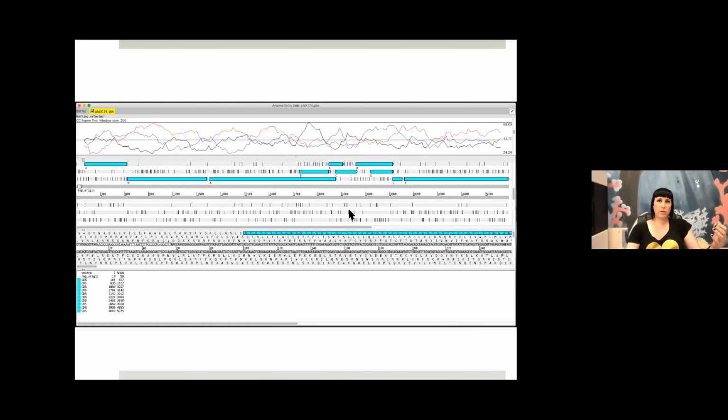And I've already shown this because I didn't expect to, but essentially the output from PHANOTATE is identical to all the steps that would have been done during manual curation, except that it would have been missing these couple completely overlapping genes.